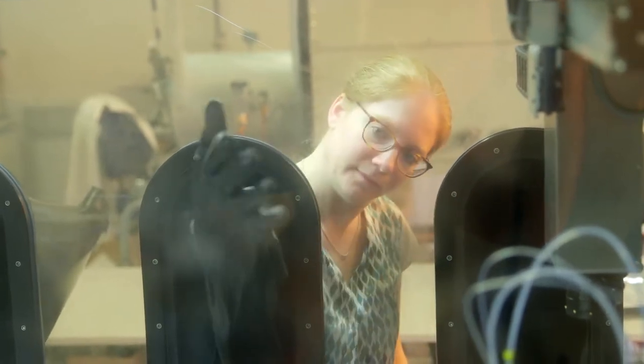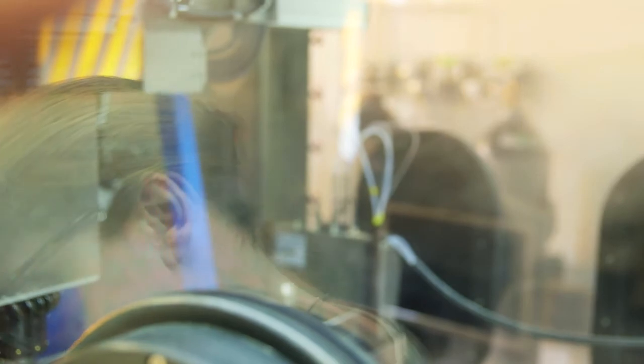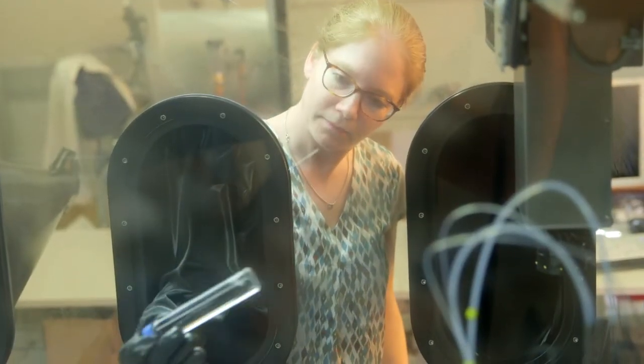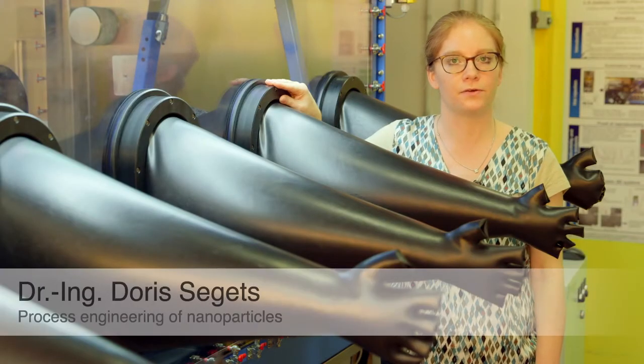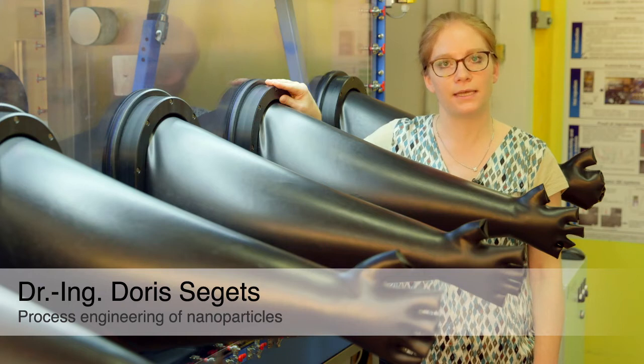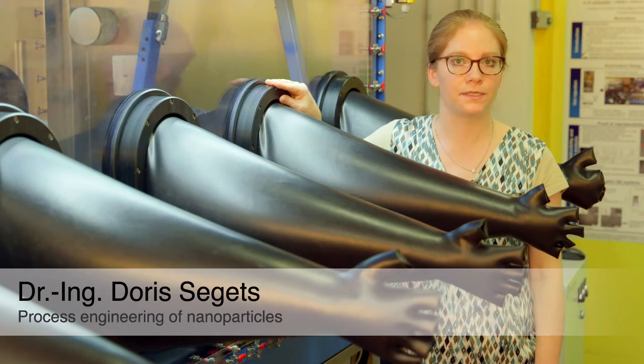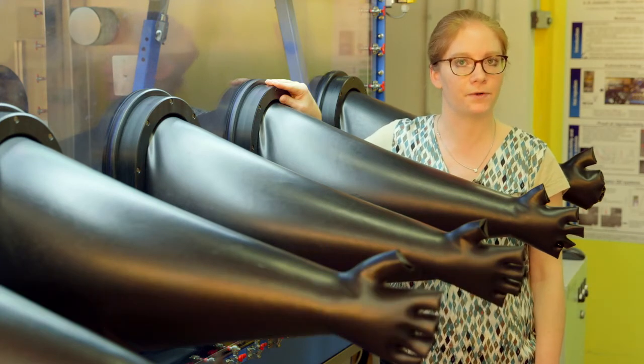Doris Siegetz is working on the development of process engineering for small nanoparticles in solution. The automated particle synthesis reaches a new level of reproducibility and controllability. This minimizes minor variations in processing that can severely impact product features.